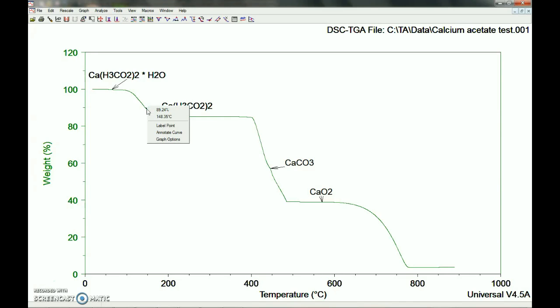This mass right here is at about 89%, close to 90%. If you were to figure out what the molecular weight of calcium acetate monohydrate is, it's about 176, and the mass of water is about 18. So 18 divided by 176, you get about 10%. So right here would be about when your water is gone.